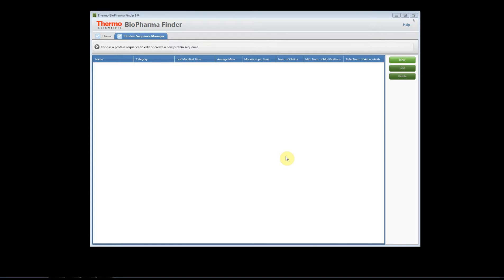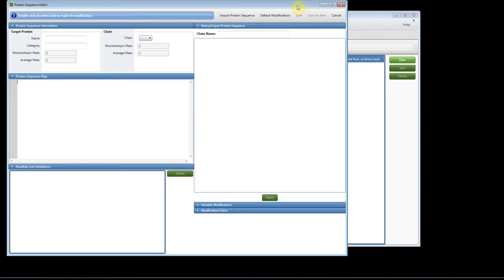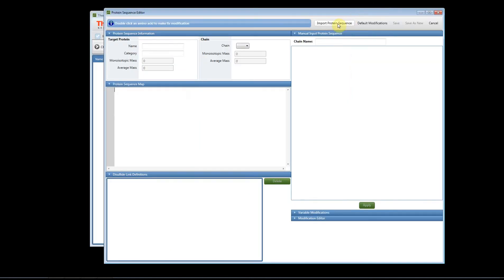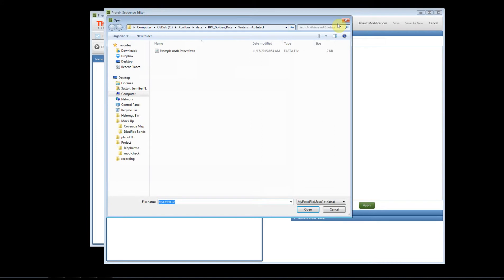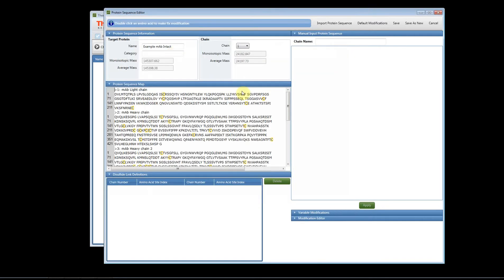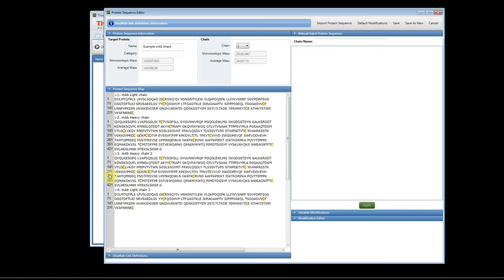We are in the protein sequence manager tab. We're going to add a new sequence, so click the new button. We're going to import a protein sequence, and in this example I'm going to open a FASTA file.